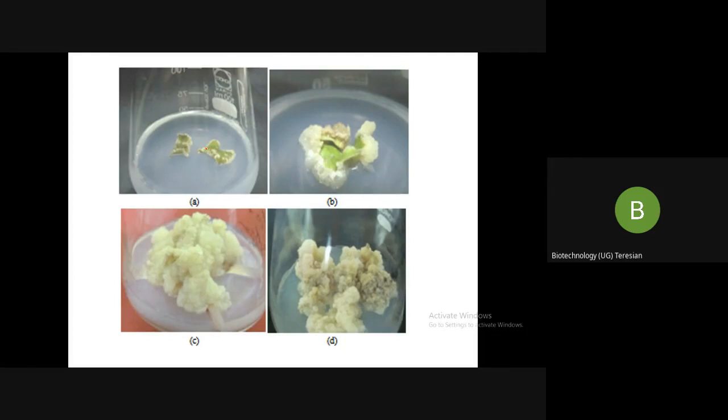It is placed on the nutrient media consisting of a suitable proportion of auxin and cytokinins to initiate culture, so that it can develop into a new plant. The explants on such media exhibit callusing. I have cut the plant under aseptic conditions, placed it into my solidified media, added my cytokinin and auxin, and then you see my explant turning into a callus.